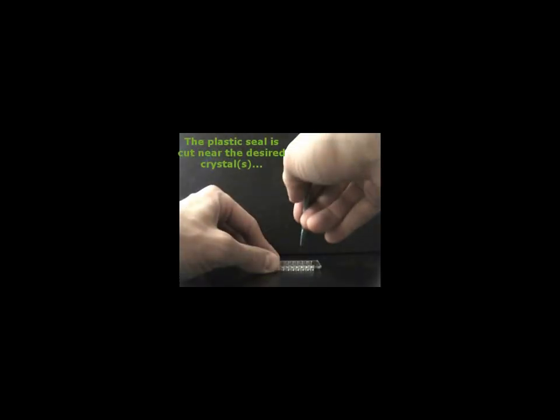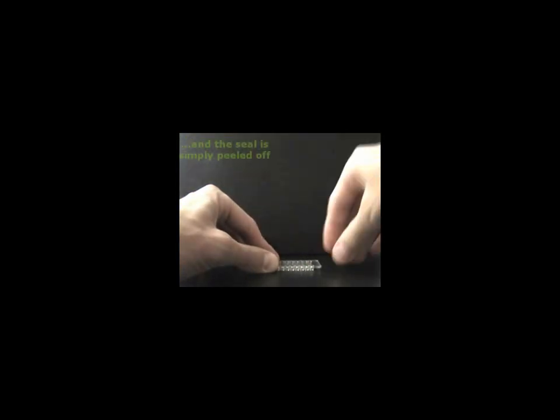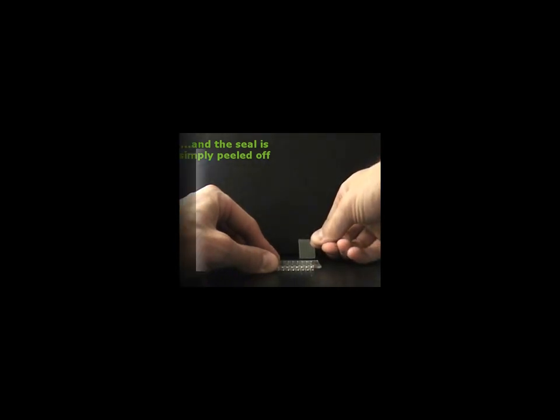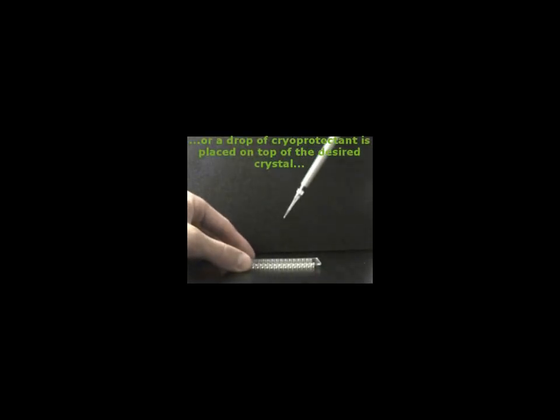As discussed at the beginning of this presentation, crystals grown with the MPCS are diffraction-ready — large enough for diffraction experiments and easily extractable from the peel-apart crystal card. Simply cut the thin sealing layer near the desired crystal and peel back the plastic. This will open up the microcapillary for extraction of the crystals with a cryo-loop. Alternatively, a drop of cryoprotectant can be placed on top of the exposed crystals and the crystals can simply be pulled out.